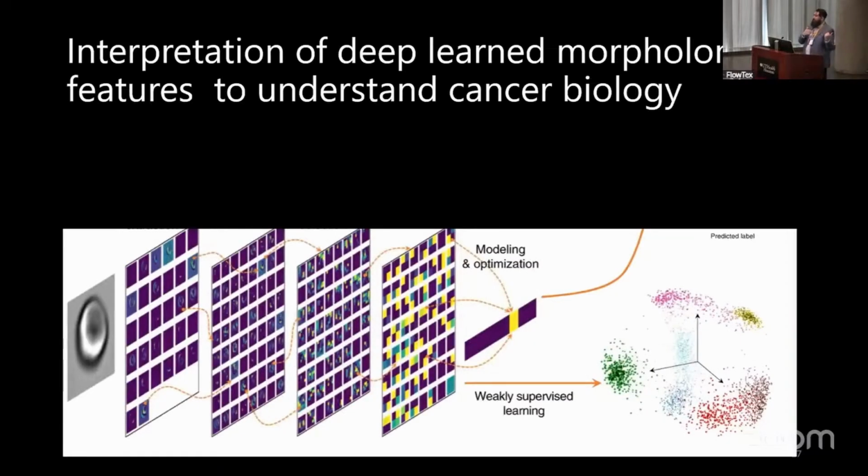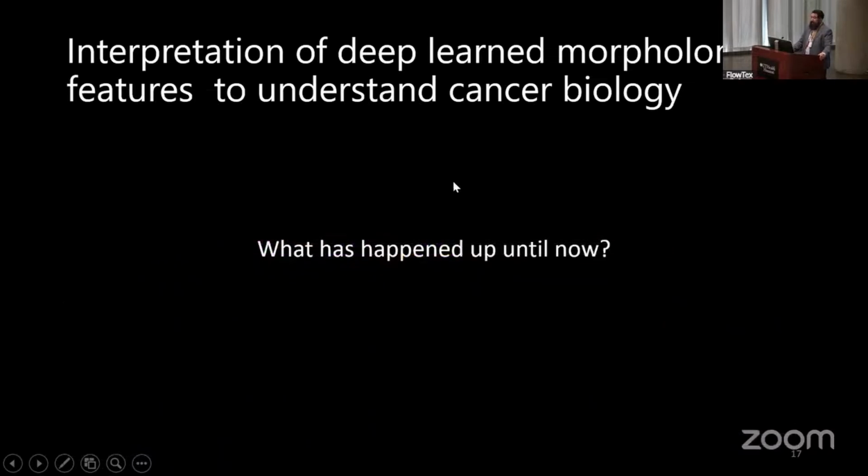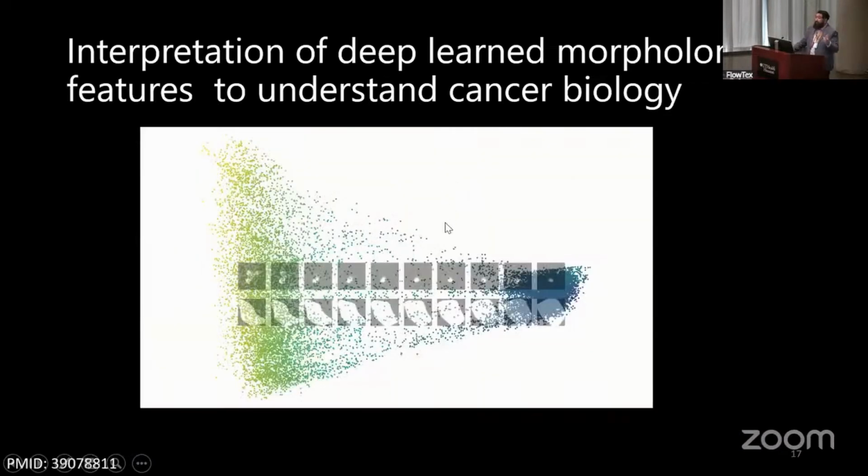I'm sure you all have seen this from Deepometry and Carpenter and her group over there, but I show this so that way you have a cell, you're entering the network, you might catch edges in the first few layers, then you're going to catch things such as texture or differences in shape. But as it goes on, it's more and more less interpretable. So let's open that box, but we need to change the model from the beginning.